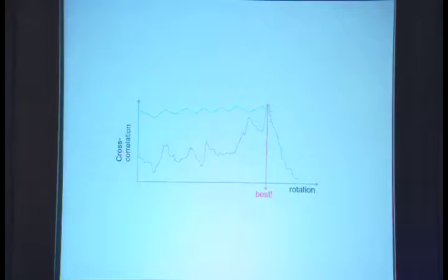In maximum cross correlation or least squares, it's possible that some of them are assigned, and then they get stuck in that minimum, and it's very difficult to get out of it. In maximum likelihood, it doesn't assign. It tries to keep this as kind of equal weightage. But as the iterations improve, hopefully it tends to find the best peak.